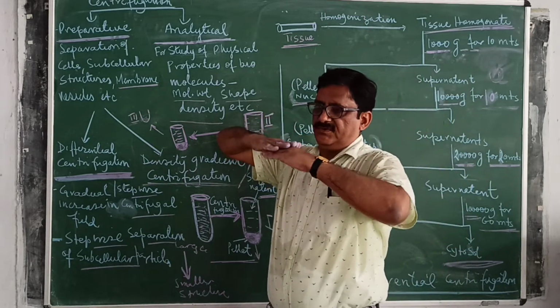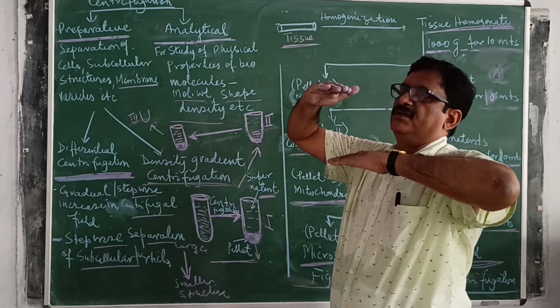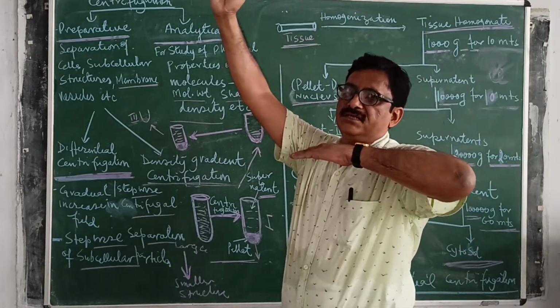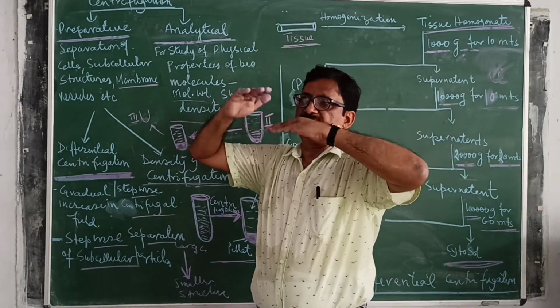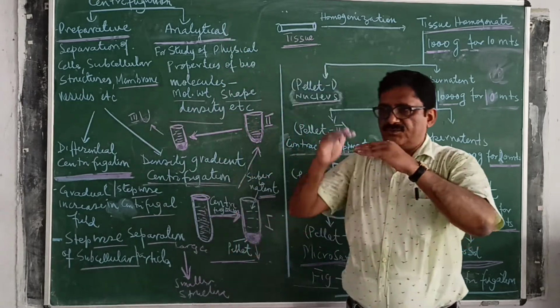First the minimum centrifugal field is applied. In the next step, a higher centrifugal field is applied. In the next further step, an even higher centrifugal field is applied. That means the centrifugal field is increased in a stepwise manner. That results in separation of smaller molecules.